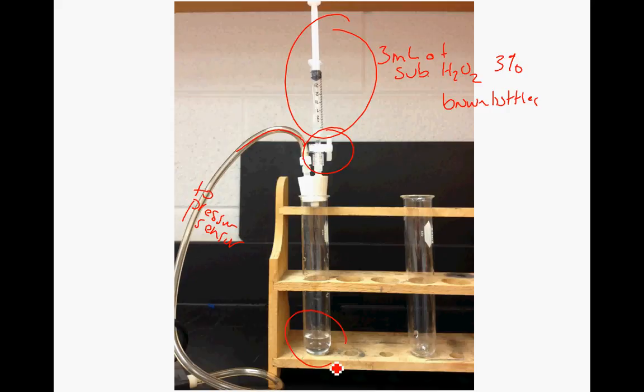Then in the tube down here goes 1 milliliter of the enzyme, and we're going to be using the 400 international unit concentration of enzyme. Right? We had some groups using a 600. You weren't paying attention back there to which one you were grabbing. Right? So everybody's using 400 international unit there, and 3 mLs of the 3% peroxide up here. Unless, of course, you're varying enzyme concentration.